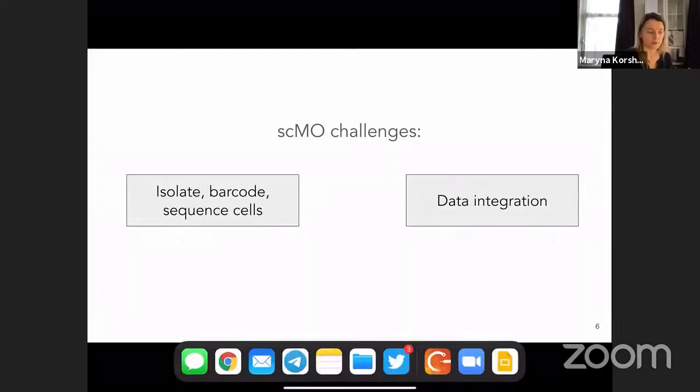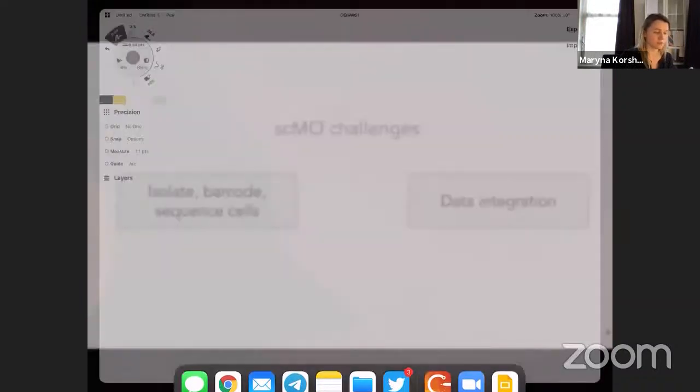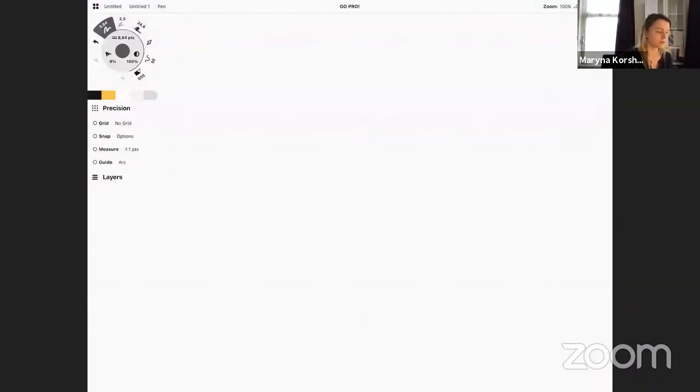But let's become closer and more familiar with different single cell omics tools. Let's make a note, or a graph, of different single cell multi-omics methods. Let's start with the methods which are already well known, linked to single cell transcriptomics.